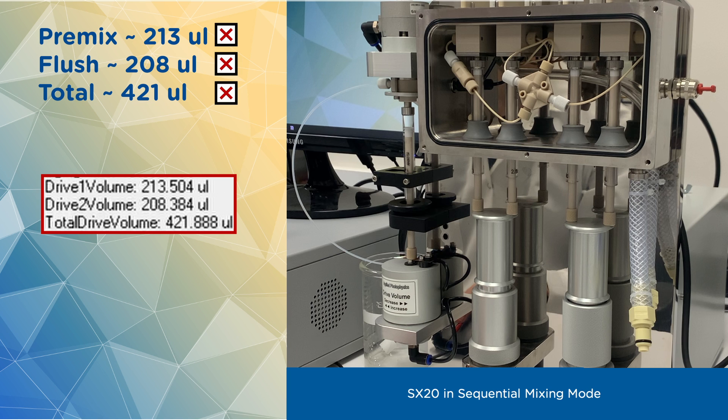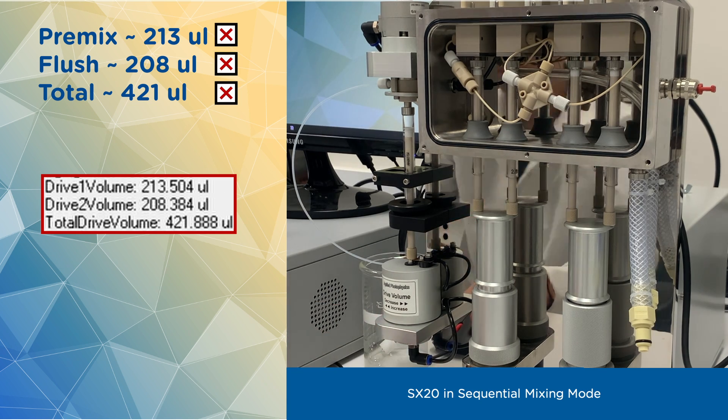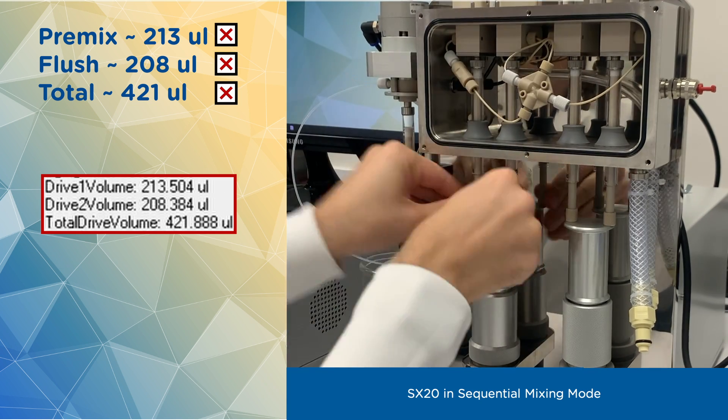If your total volume is close to 400, great! Now you have to make sure your drive volumes are within a margin of error. If not, adjust the total volume first. In our case, I have purposefully overdialed it and need to reduce it.